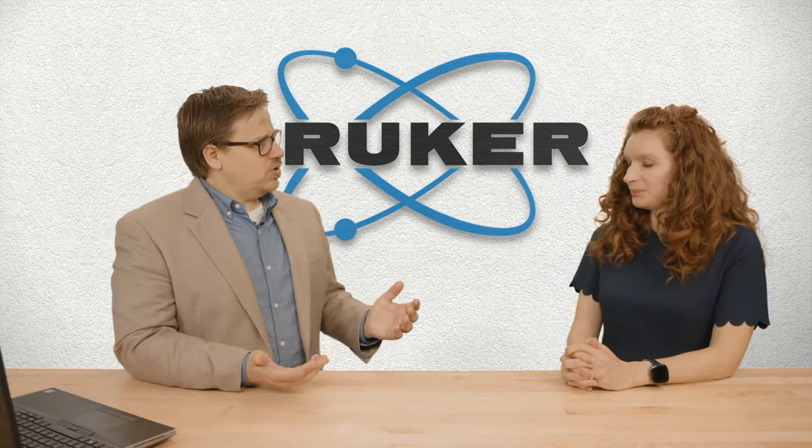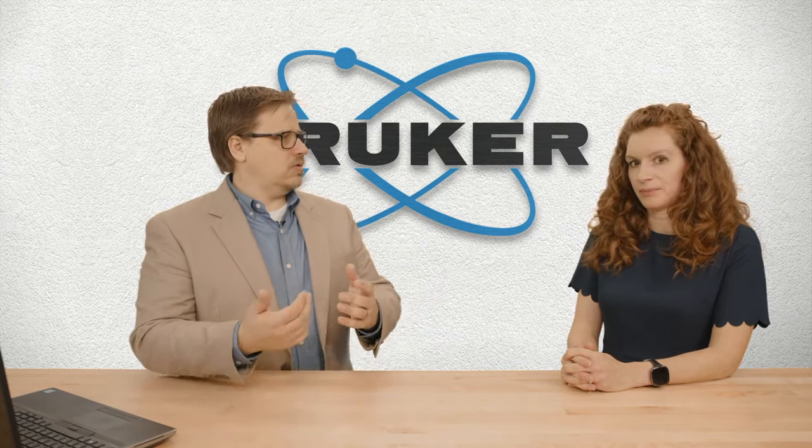So when exactly would you use one of these EDXRF machines, and when would you prefer the WDXRF machine? So ED and WDXRF can either work together, so an EDXRF could be a backup for a WDXRF. WDXRF have better resolution. They can reach lower detection limits. But EDXRF, on the other hand, measures the whole spectrum all the time. So it's a nice thing if you have to screen things, or if you routinely measure something and you want to go back to it and see why there was something wrong.